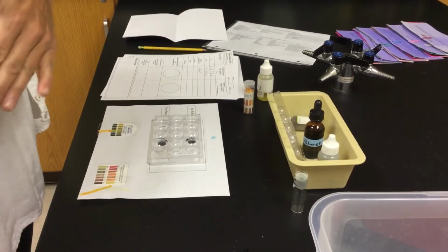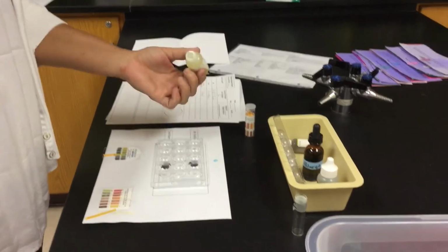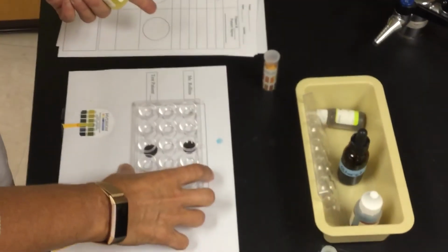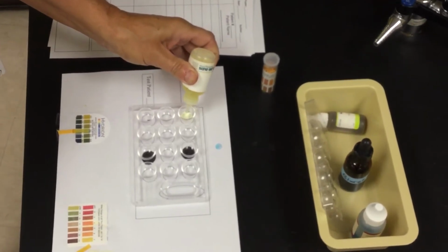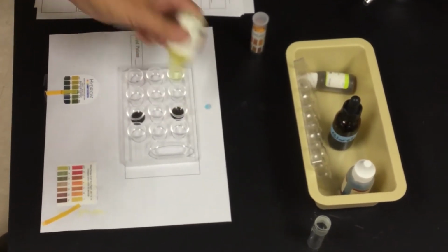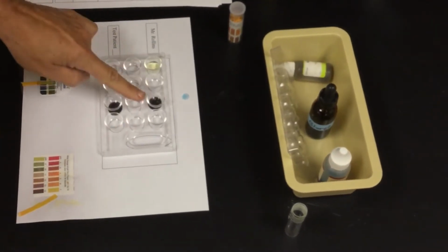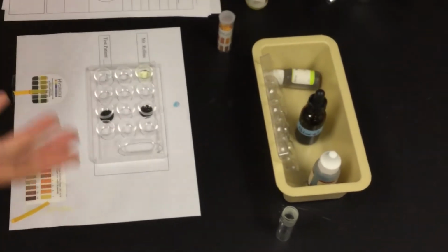So while that's sitting in the hot water bath in there, we're then going to take Rollins' urine and look at our proteins and chlorides. Same thing. We have 10 drops, and we're going into well number 1 here. You can actually see it right through. So 2, 3, 4, 5, 6, 7, 8, 9, 10. If we have a little more than 10, that's fine. And then I'm going to add 1 to my blackened-in well, and that's going to test for my chlorides. So we're testing 2 different things here, proteins and chlorides, and I'm doing them in a specific order. My sugars, that's on heat right now, takes about 5 minutes.